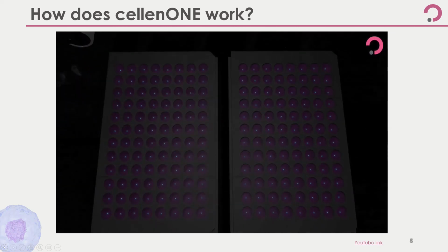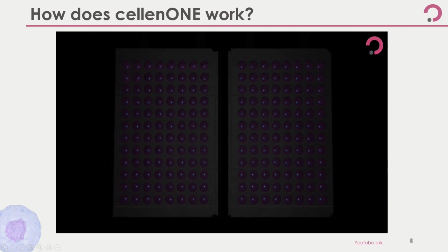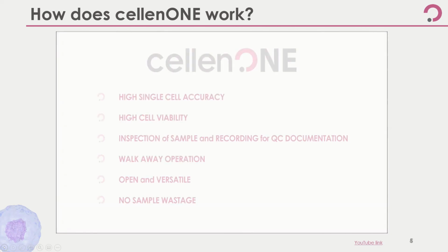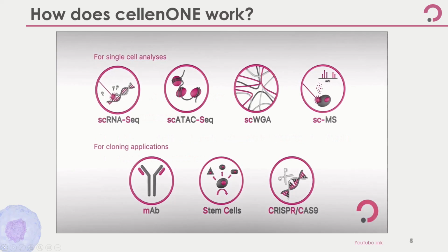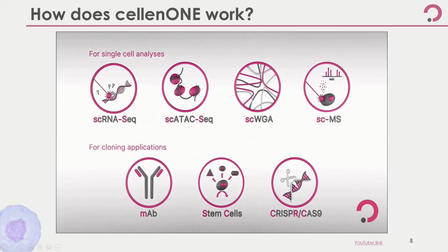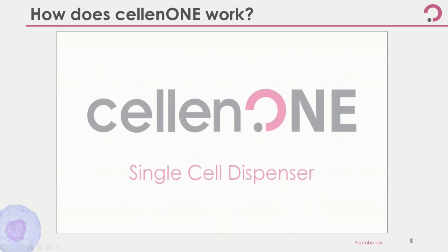So in summary, the technology provides you with a very high accuracy. It also provides a very high viability, but I will not describe this, and it allows you to inspect your sample. You can see if you have debris and all those other things.